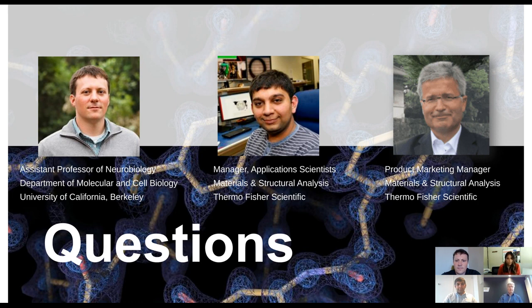Okay. You also talked about the flashing interval that is fully integrated into EPU and Tomo software. But when is such a flashing procedure triggered, and what is the interval between the flashing generally? Mark, I think that was so typically, when the beam current drops 10%, then you get a trigger of a flashing procedure. In the Nature paper of Nakano et al., we have reported that such interval is roughly 8 hours between the flashes, but we have also seen on our internal instruments that we can easily reach intervals which are more than 10 hours, so really a long time.